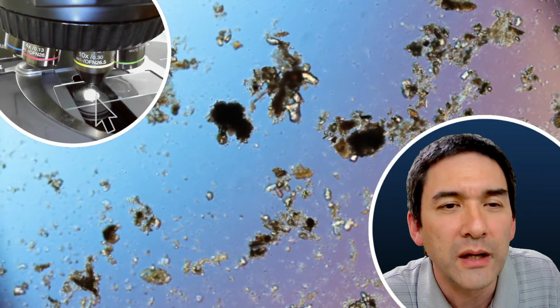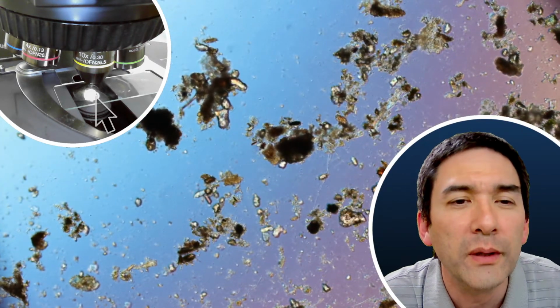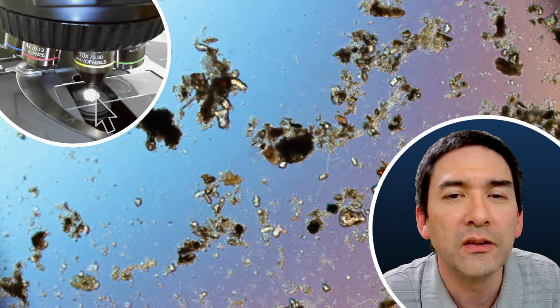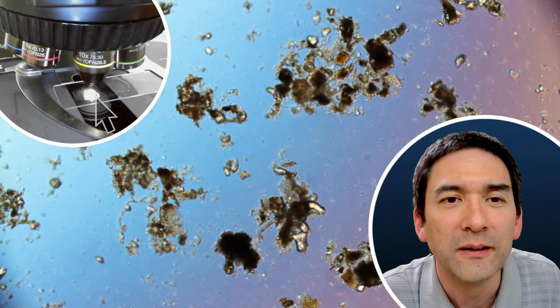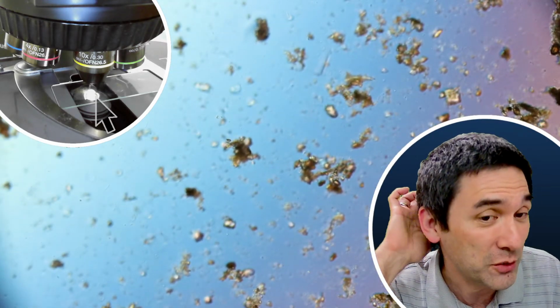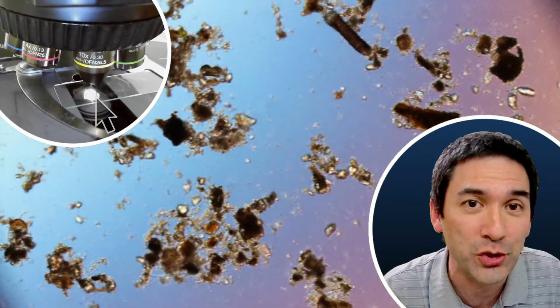So what I'm going to do now is, sometimes if there is a very slow movement, it could be something. But this is too small. I did prepare a video, just as an emergency backup. This is really upsetting because yesterday when I put the moss sample on the slide, I could see three or four tardigrades right next to each other.